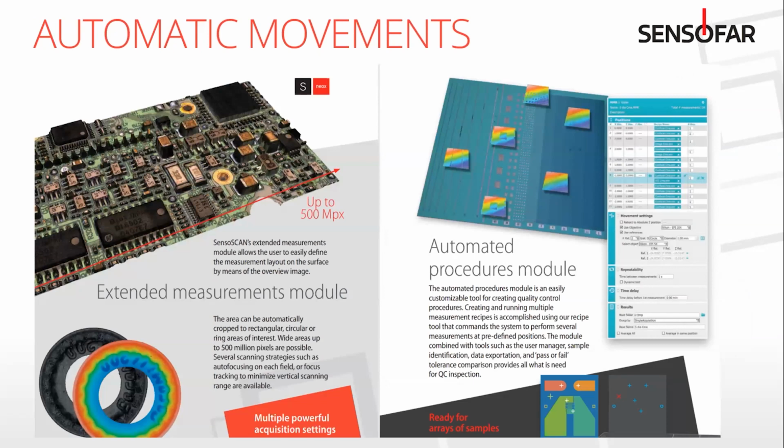So we've also got options for automatically moving the stage. The first is the extended measurements module. That just allows you to stitch. So if you've got multiple fields of view that need to be stitched together, that's very easily doable. And if you say, I want to stitch in 4 places around this large dish that I'm inspecting, we have an automated procedures module that'll allow you to do that. So you can look at multiple recipes at different locations on the sample that you're looking at. So that's the movement control.